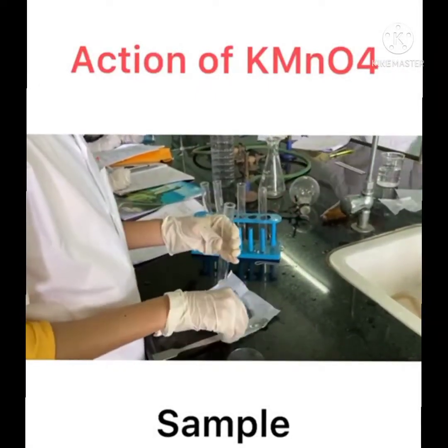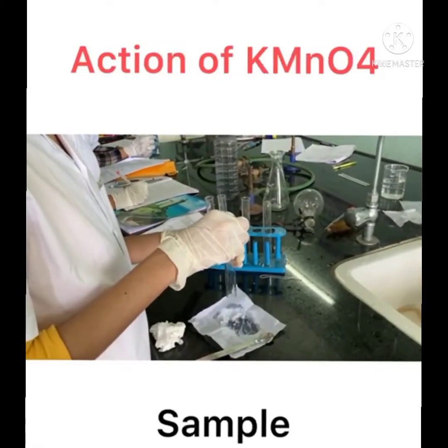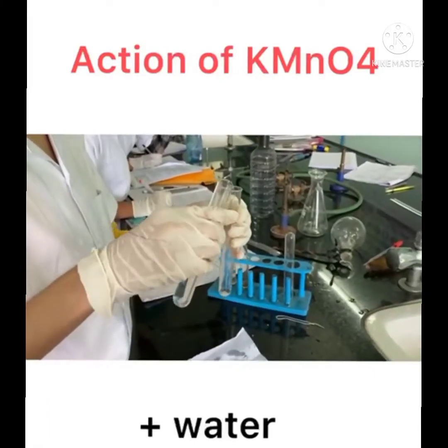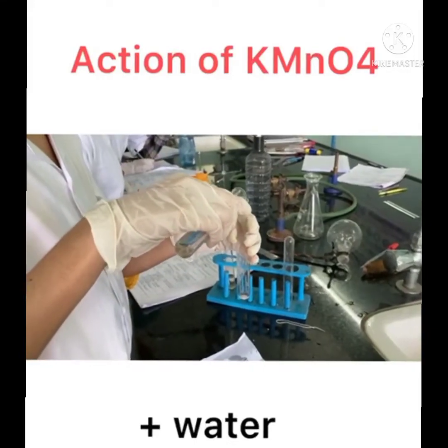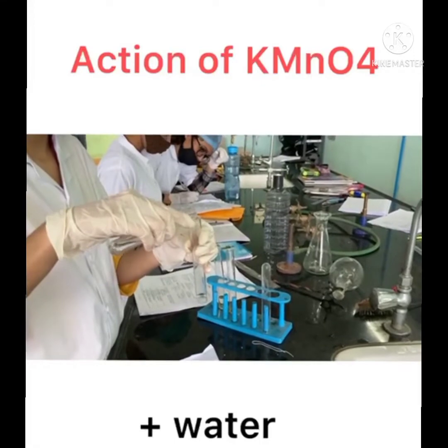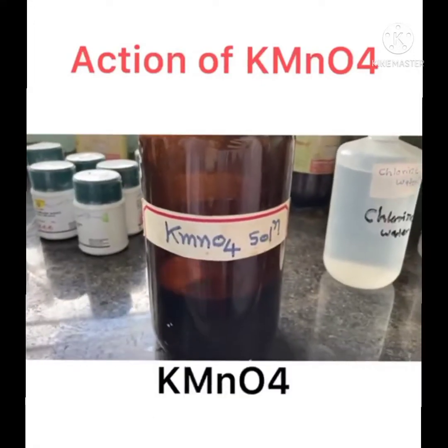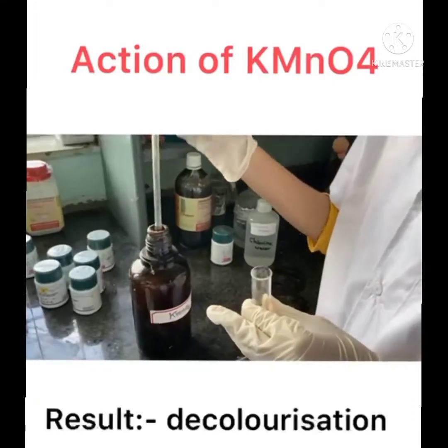Then we do the action of KMnO₄, in which we take a test tube and add 0.2 gram of sample and 2 ml of water, along with a few drops of neutral KMnO₄ solution. We can see that our solution is decolorized.